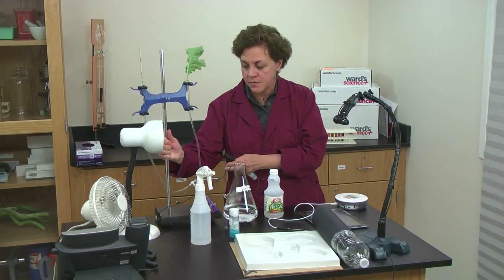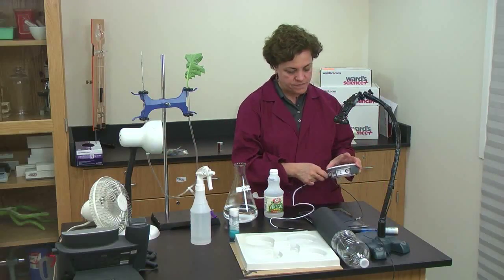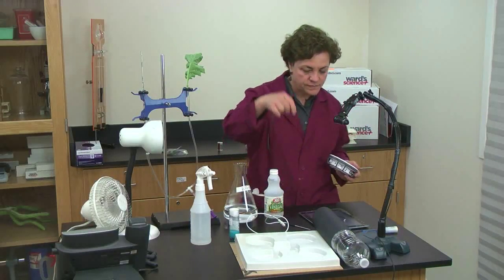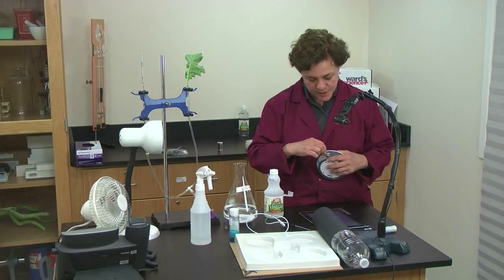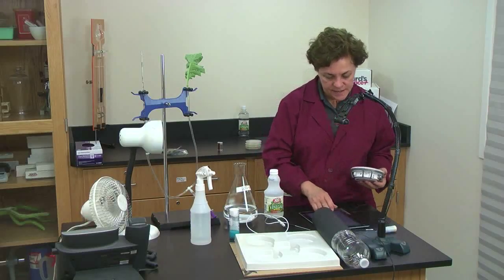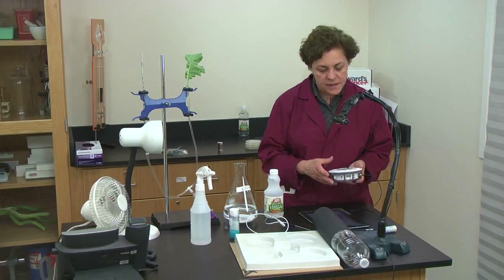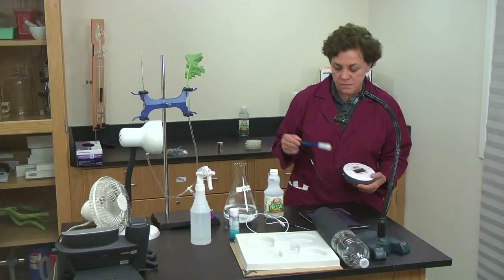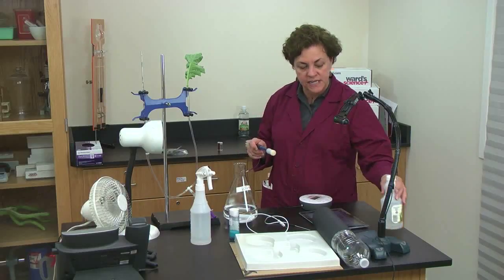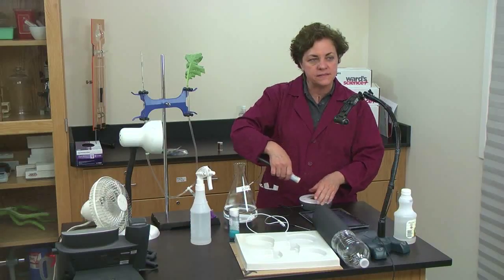So they can take the pH probe and connect it to the Datahub. So I'm going to stop the temperature. I'm going to take the pH probe, put it into where the pH probe goes. And then I would have to change this to be pH, and I could measure it that way. Because the pH isn't changing much, what I suggest is instead of actually putting it on the iPad, this is one where you're taking one measurement.